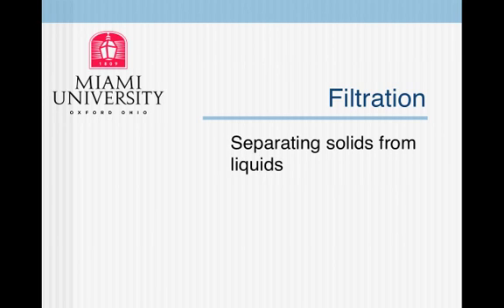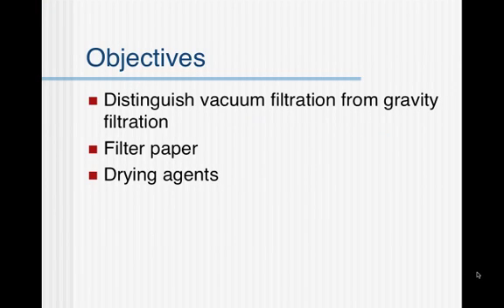This is Rich Taylor, Miami University, and the topic of this presentation is filtration, the separation of liquids from solids, typically at the end of a reaction. The objective of this presentation is to distinguish vacuum filtration from gravity filtration, to talk a little bit about filter paper, and then also talk about drying a solvent, the use of drying agents.